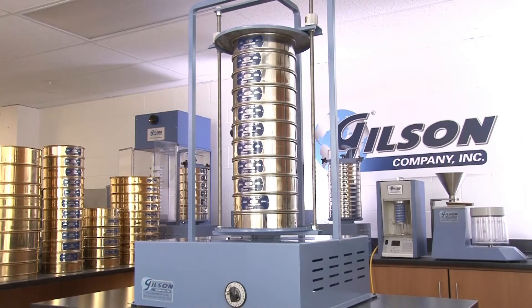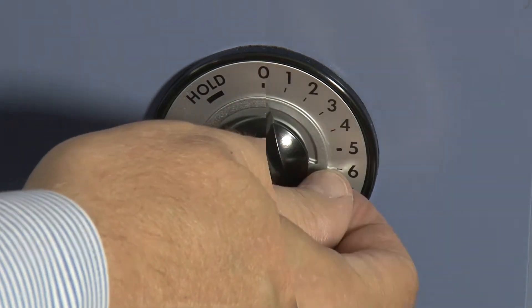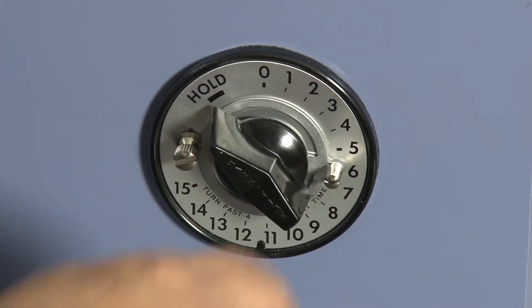The reliable SS14 sieve shaker has a 15 minute mechanical timer with an adjustable knob stop for improved repeatability and a hold feature for continuous running.